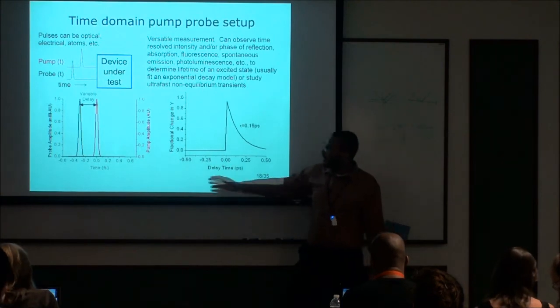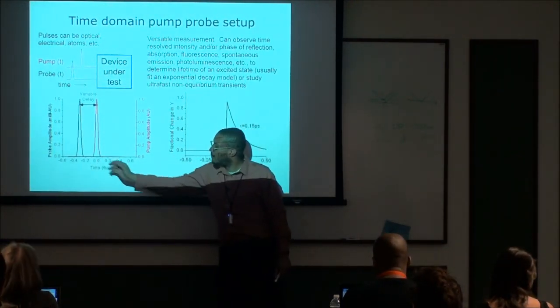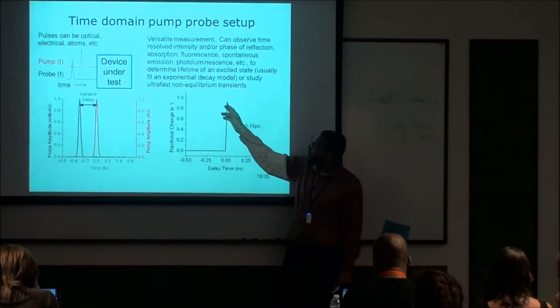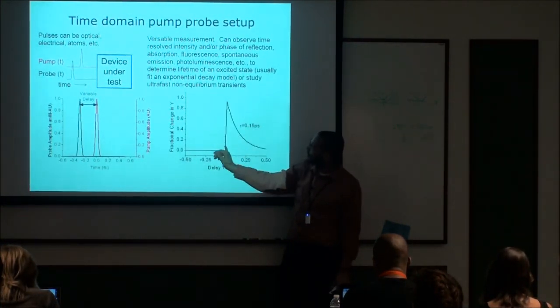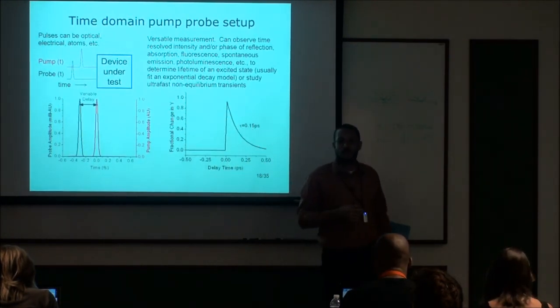So the idea, I pump it at one time, and then I probe it at some other time. If I probe it before I pump it, I get no change. If I probe it after I pump it, for a short moment in time, I'll get a very large change, and then I'll get a decay as this returns back to equilibrium.